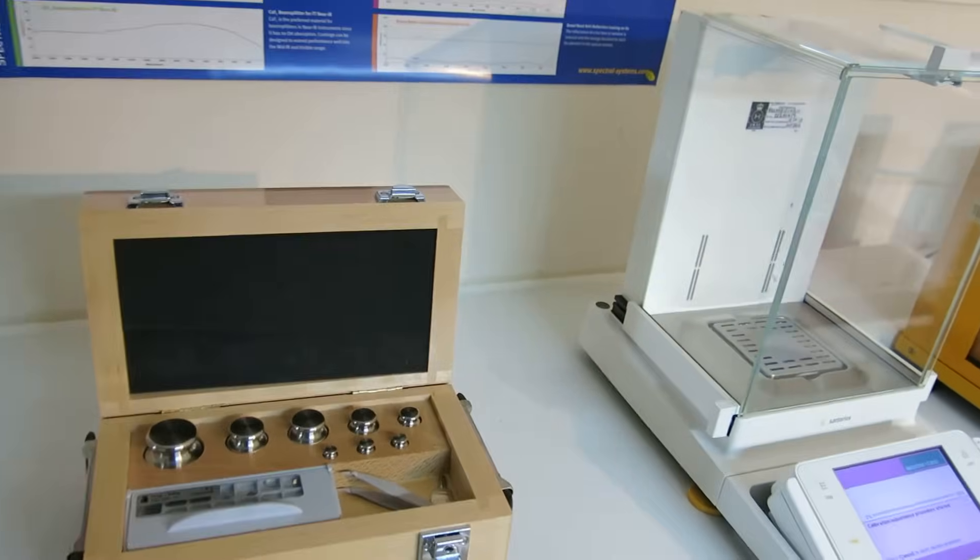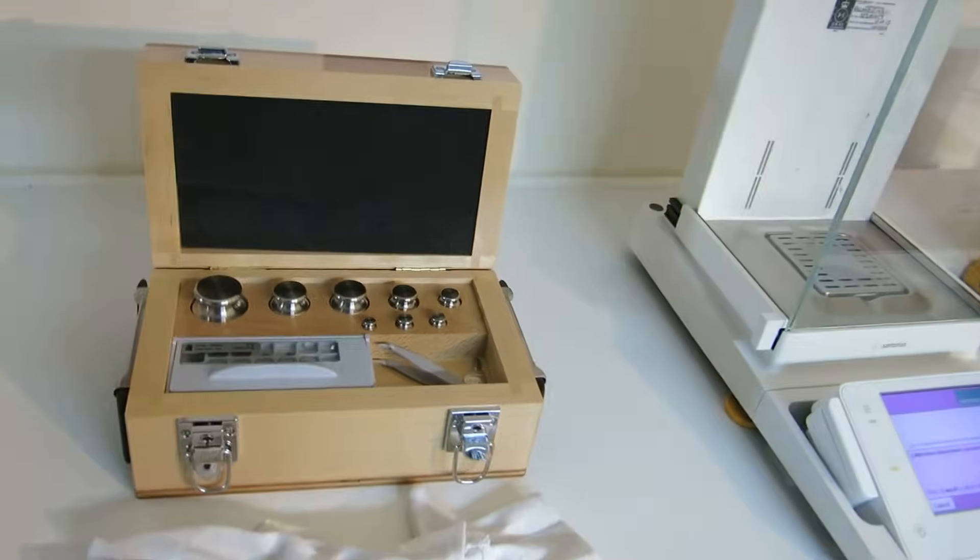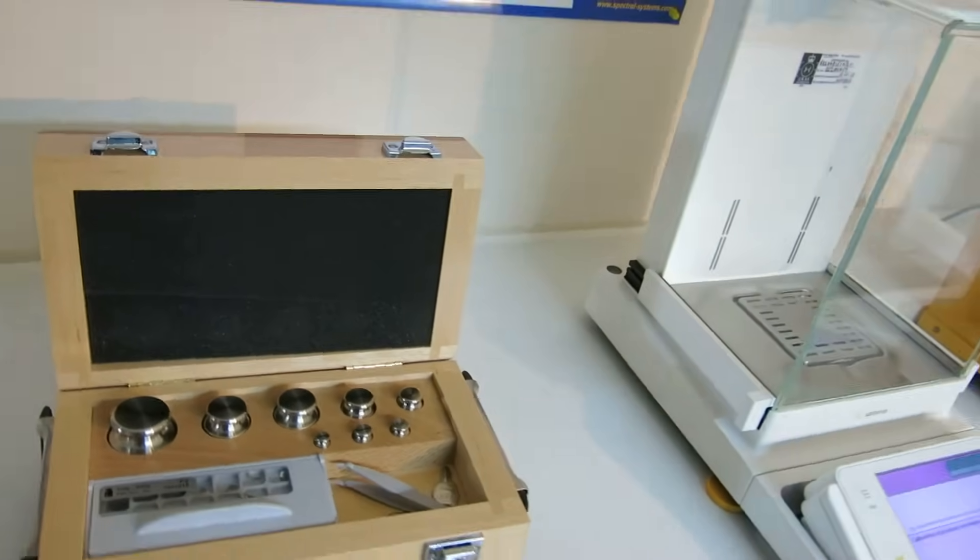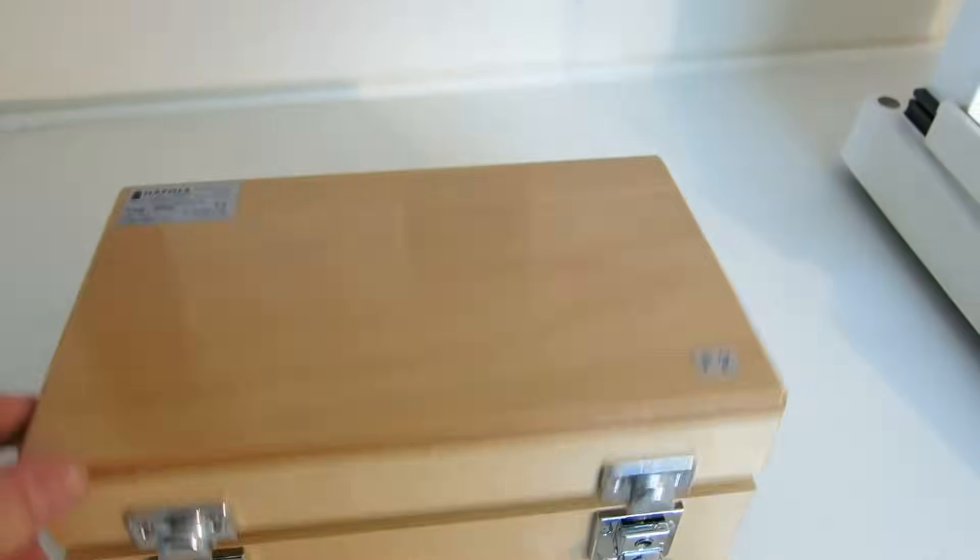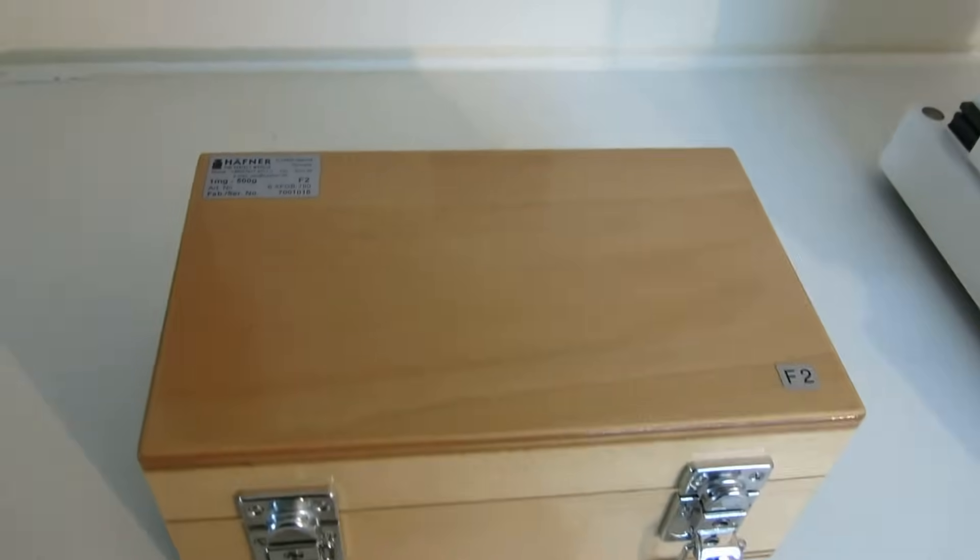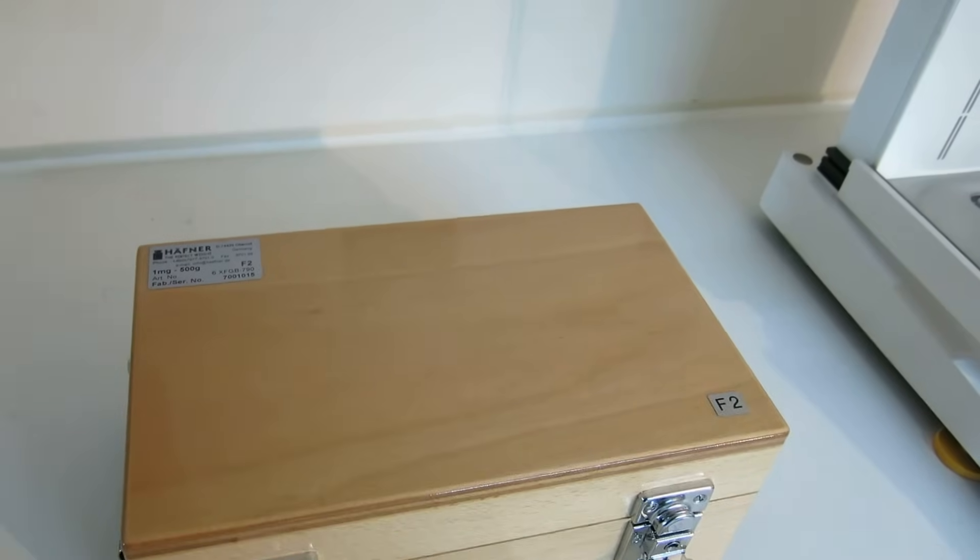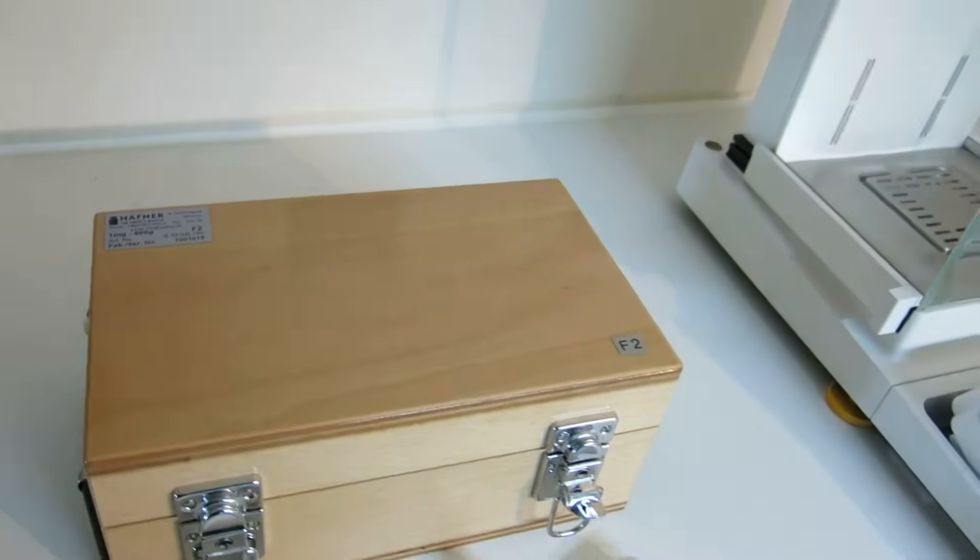We've got the 1mg to 500g. This is the F2 grade. Extremely well made. Hafner. Made in Germany. Lovely beech box here with gloves as well. Talk to us about these. 1mg to 500g Hafner weights.